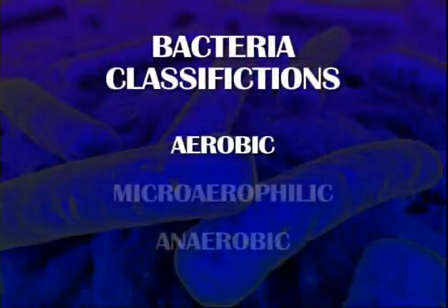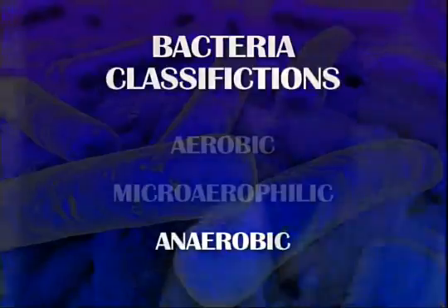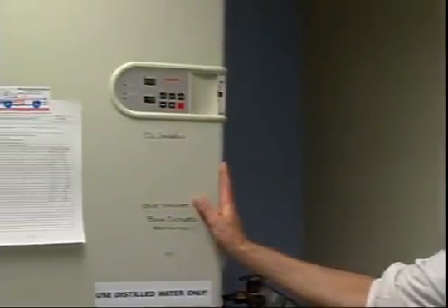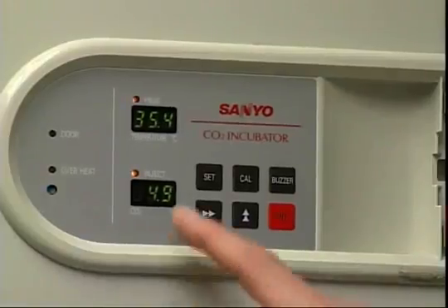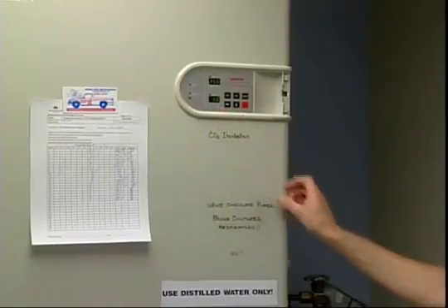Lastly, I want to address the atmospheric conditions required for bacteria to grow. Bacteria will either be classified as aerobic, microaerophilic, or anaerobic. The aerobic and microaerophilic bacteria will all grow in a CO2 incubator. And a CO2 incubator is an incubator that has approximately 5% of carbon dioxide injected into it.